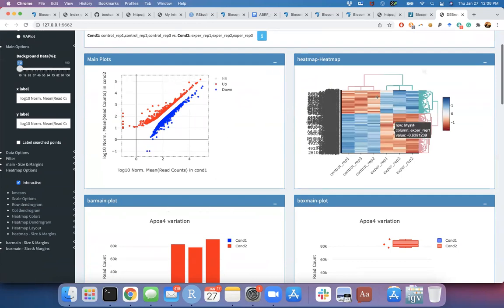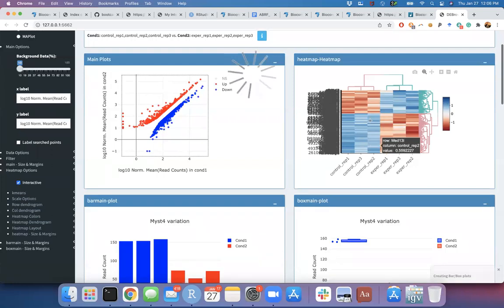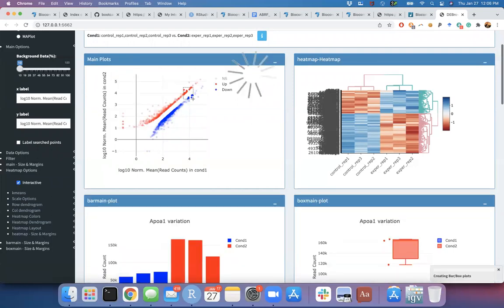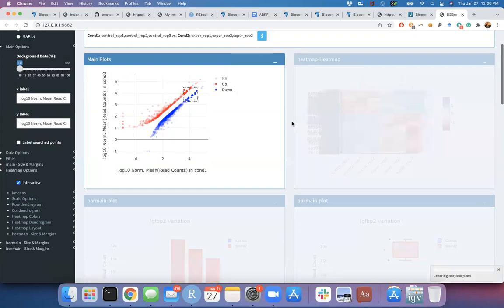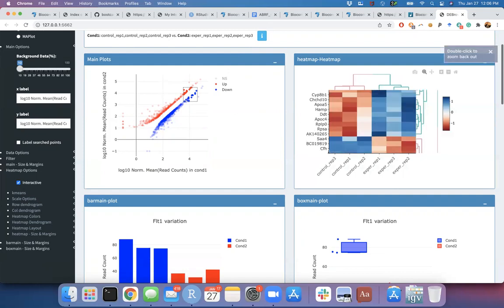The reason is that this took time. But let me do a smaller version of this to play faster. So it's coming now. Okay, this is small. See, so you can do such things here, and I see gene names and stuff.